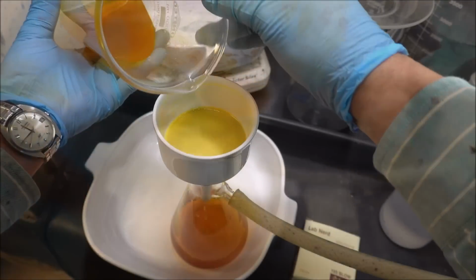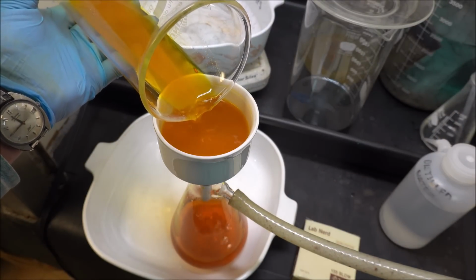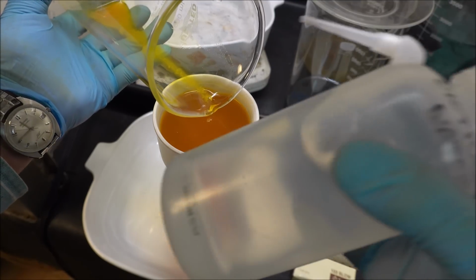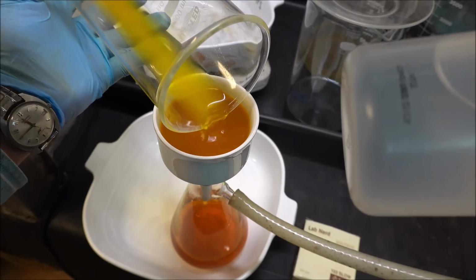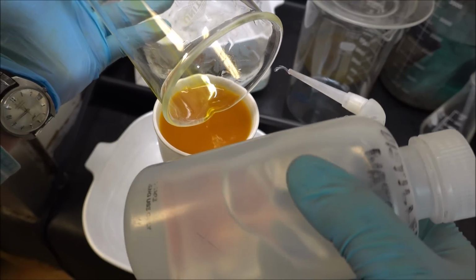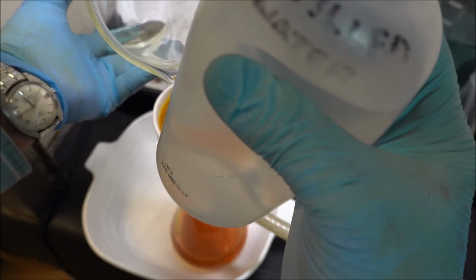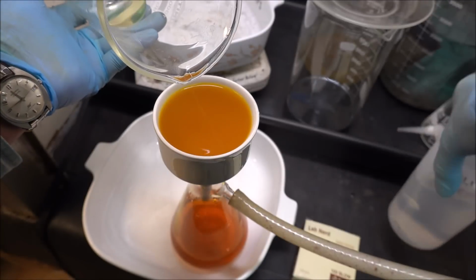We got most of this into the filter now. The solids will mainly be the filter paper that was in with the gold. It just kind of falls apart, and then we can filter it out at this stage here. Any lead that was precipitated when we added the sulfuric acid will also get filtered out here.